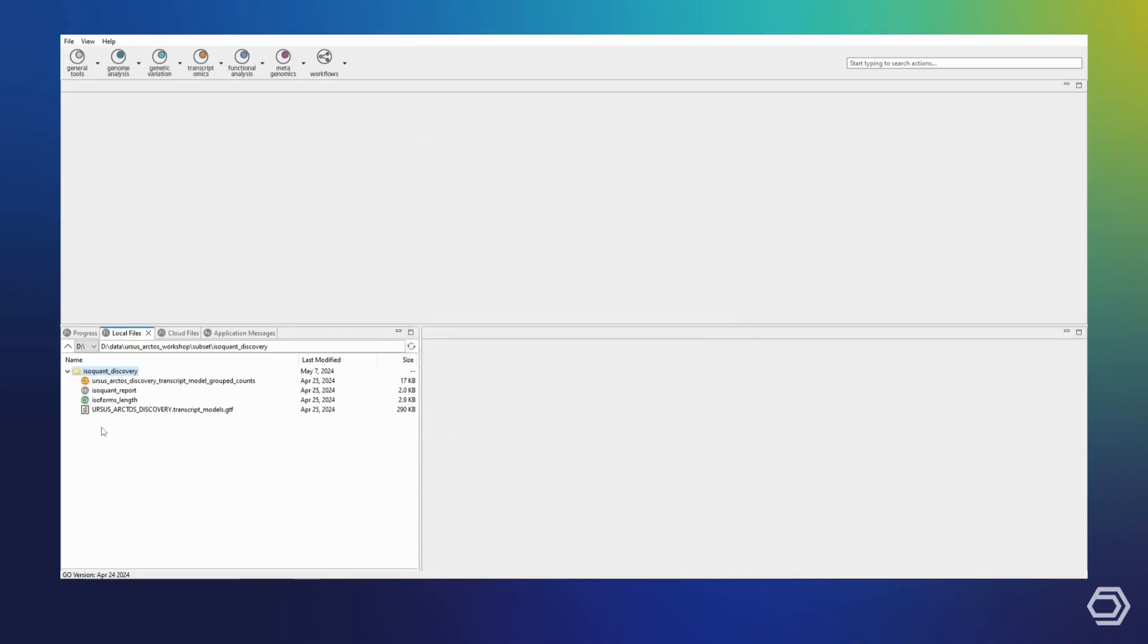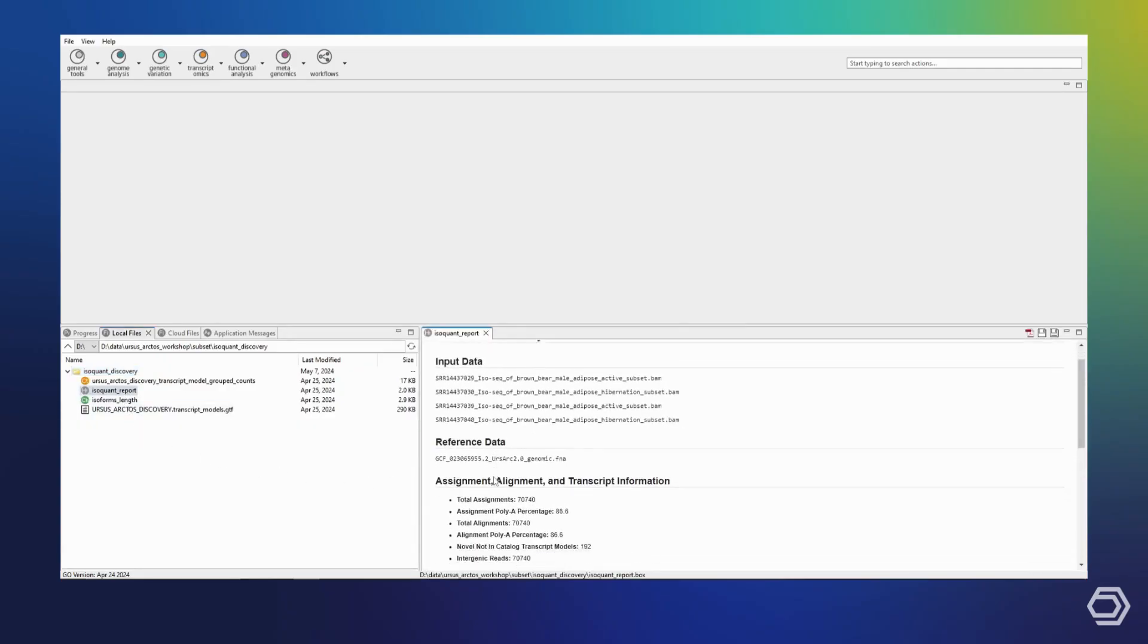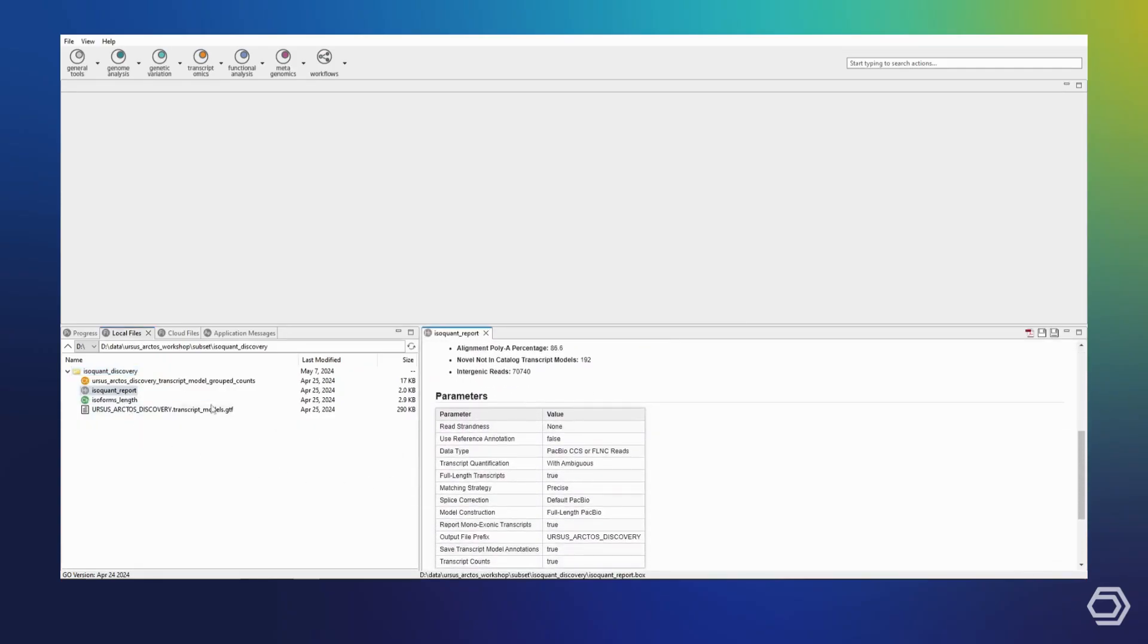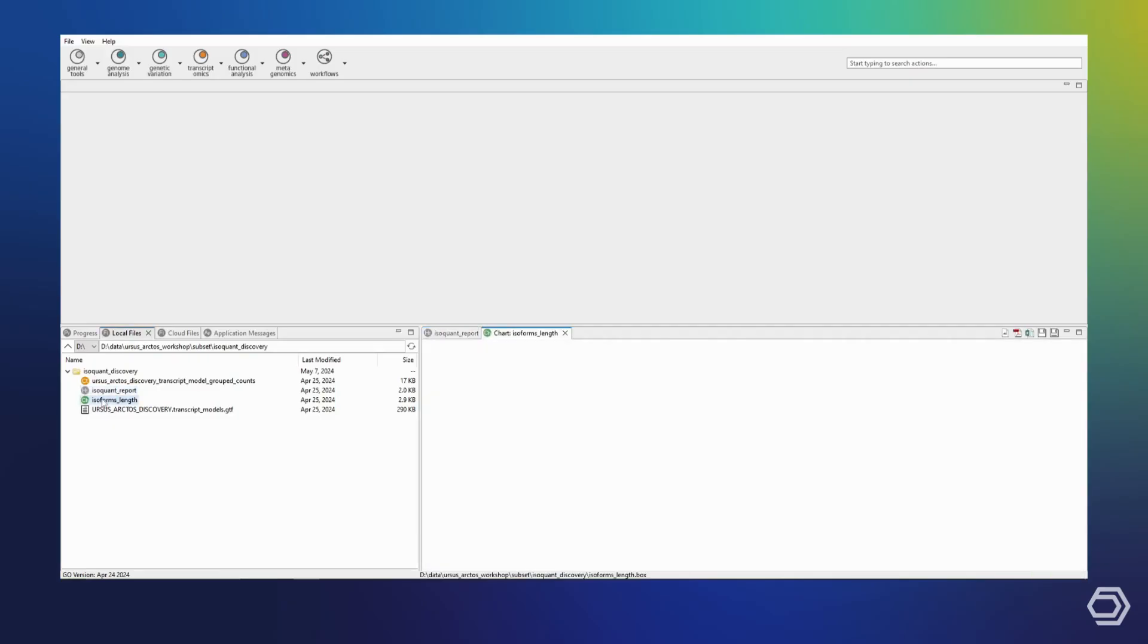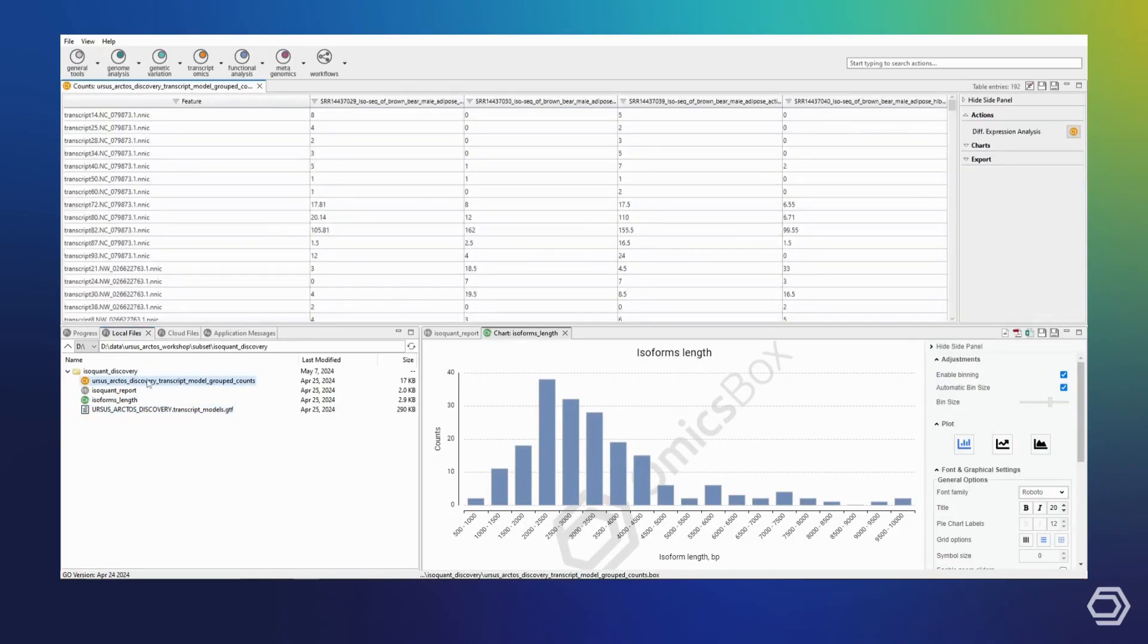Again, we obtain a report with our input options as well as some basic statistics. We also receive a GTF with our newly identified transcript annotations as well as a plot showing the isoform lengths. Lastly, we also receive a quantification table based on these transcripts.